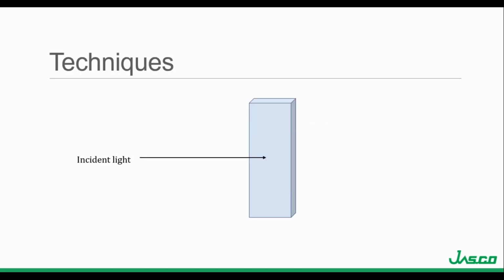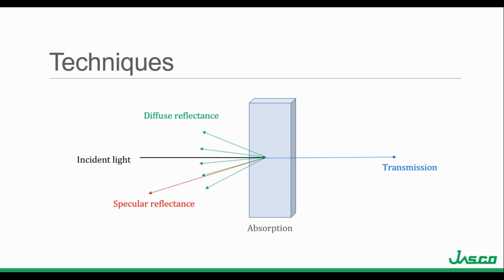When a substance is irradiated with electromagnetic waves, phenomena such as absorption, transmission, reflection, and scattering occur, and the spectrum produced reflects the interaction of waves of a certain wavelength with objects of a certain size, such as molecules.